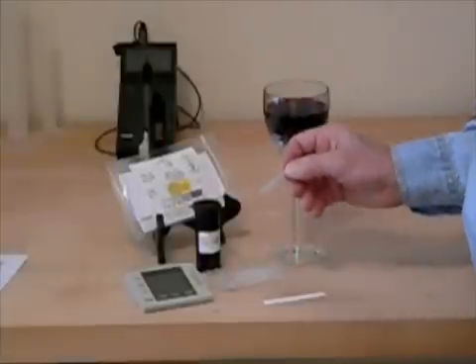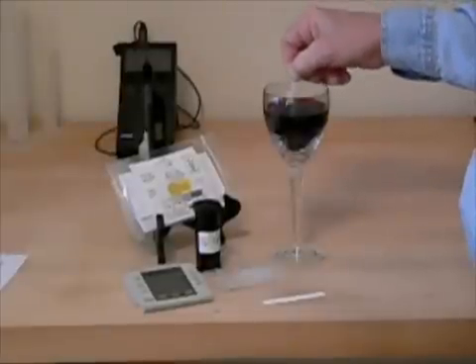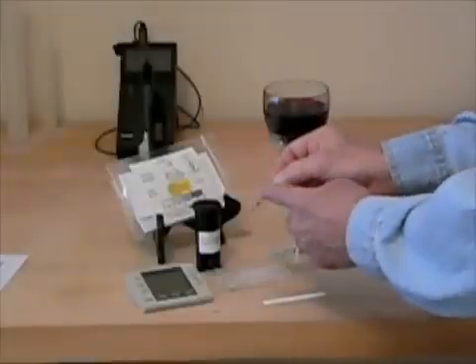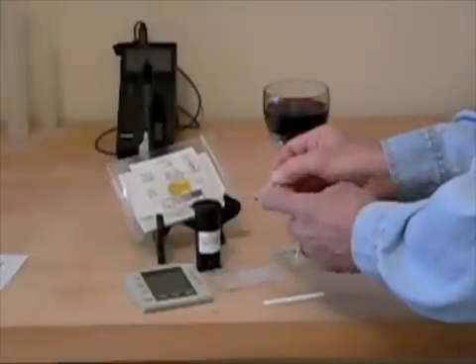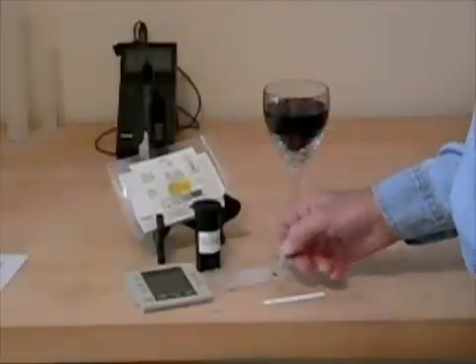To get the sample, you squeeze the bulb at the top of the sampler and place the other end into the wine or must sample. You release the bulb — the sample is contained in the straight section and the excess sample is contained in the overflow bulb.